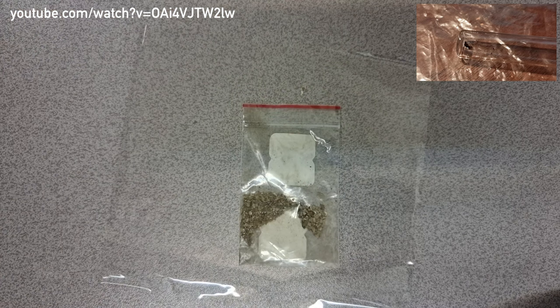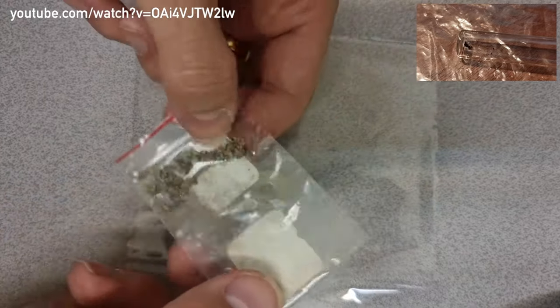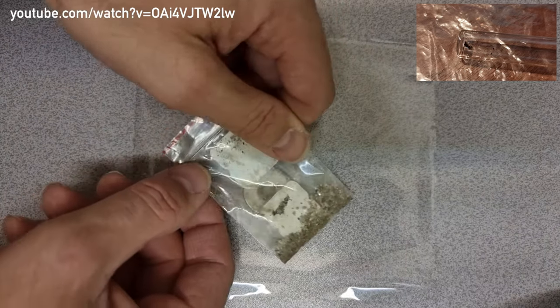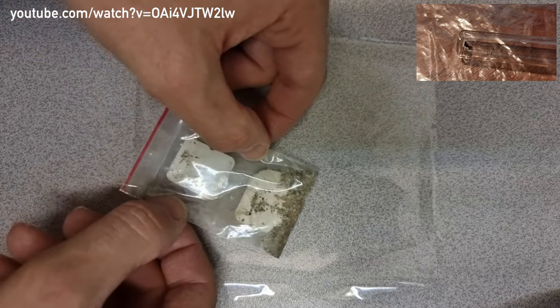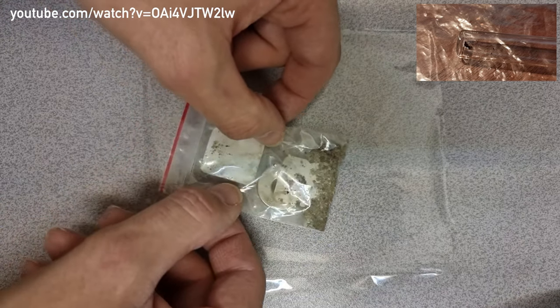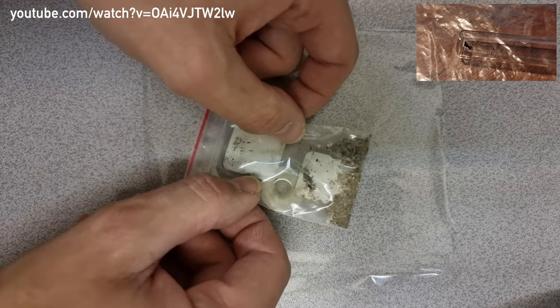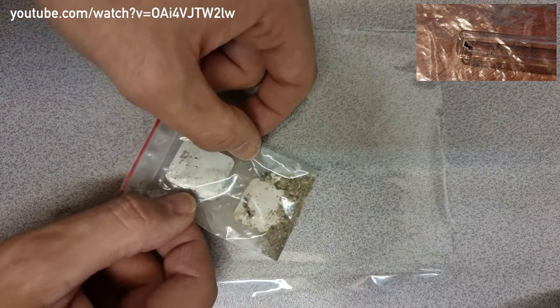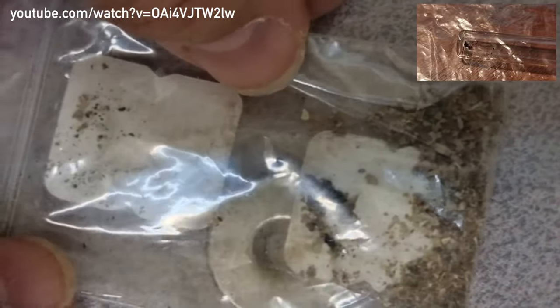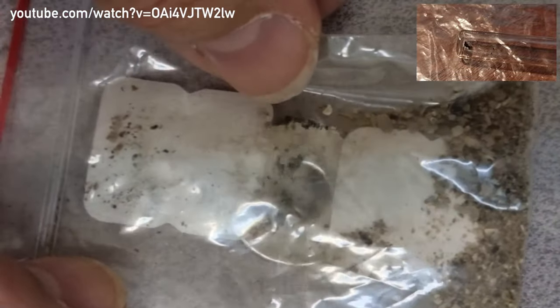Right, I'm going to get a big boy magnet on this, and we'll see what happens. So here's an ND52, and we'll put it over the white stuff, and we'll see what happens. Okay, there we go. Oh, there's a lot of stuff in there that is clearly magnetic. Now, are these the magnetic core of fractal vortex solitons? I don't know, but what I will do is I will extract some of these and we will have a look at them under the microscope. But clearly, there is a lot of material in there. Let me zoom in so you can see a little bit more what's going on. Look at that. That is a lot of material in there that is attracted to the magnet.